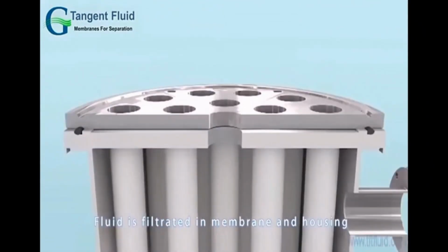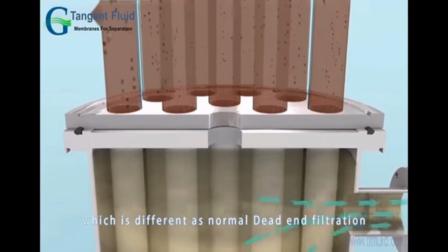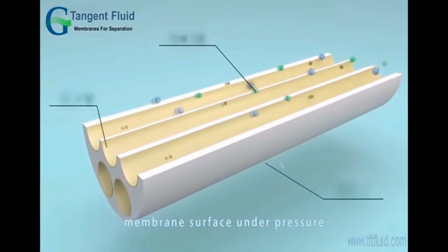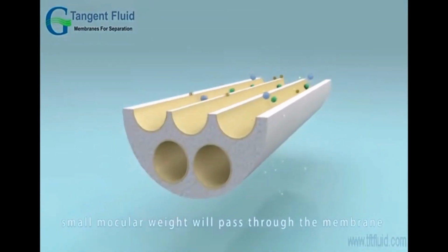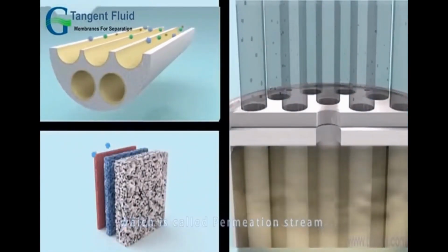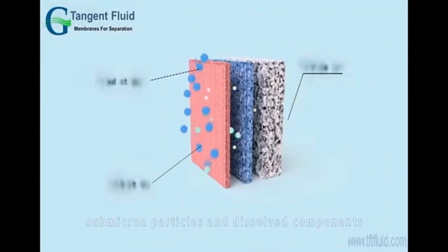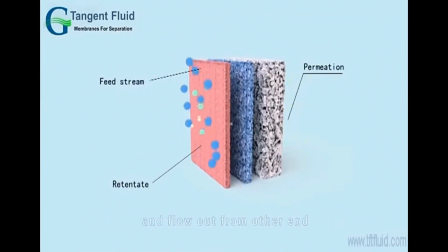Fluid is filtrated in membrane and housing by cross-flow filtration mode, which is different from normal dead-end filtration. The feed stream flows quickly across the membrane surface under pressure. The solvent and dissolved components of small molecules will pass through the membrane, which is called the permeate stream. The suspended solids like bacteria, oil, submicron particles, and dissolved components of high molecular weight will be rejected and flow from the other end.